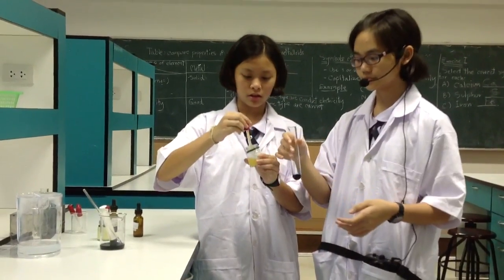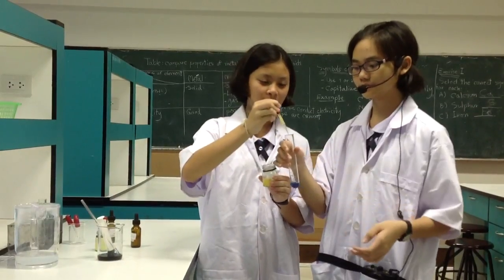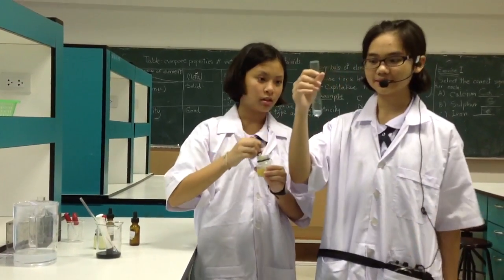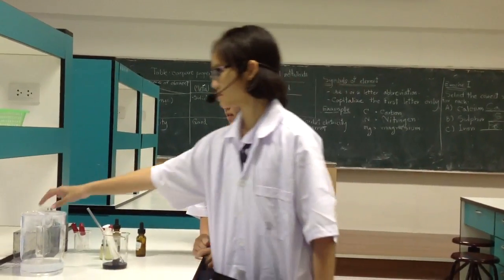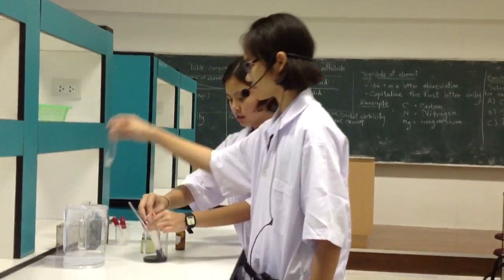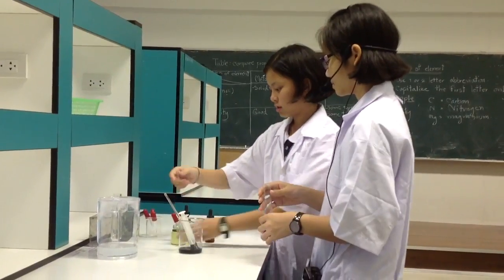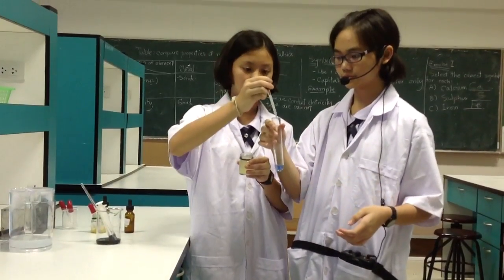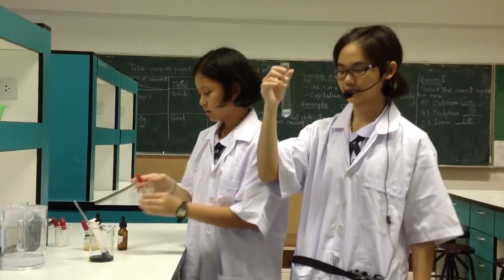Step 5: Drop pineapple solution into the testing solution. Count the drops: 1, 2, 3. Record the number again.